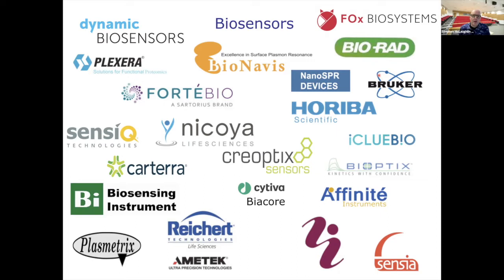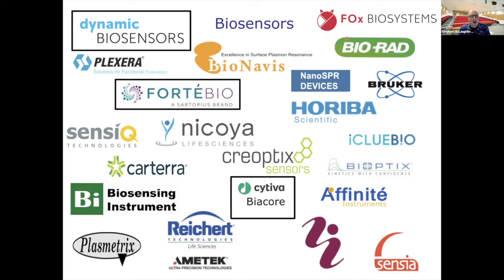Okay, first of all, there's a whole range of biosensor companies and instruments out there. In fact, yesterday I added a few more. Some of them use the same physical principles, like SPR, while others have different physical properties underneath. But I'll just concentrate on three today. These are the ones that we have at the LMB. It's important to understand the principles of each of these three, because that will let you relate to any other biosensor you use, in terms of what the controls are, what the problems could be, and how you would go about analyzing biosensor data.